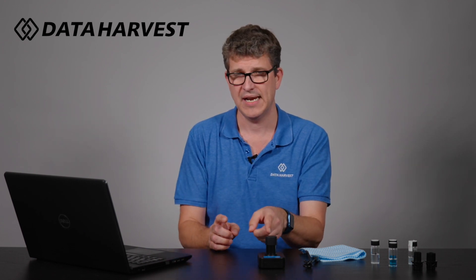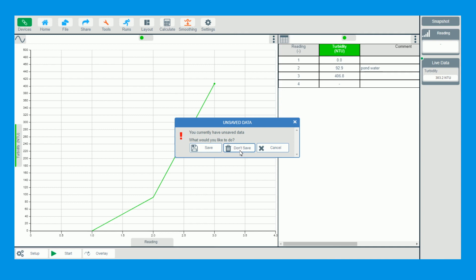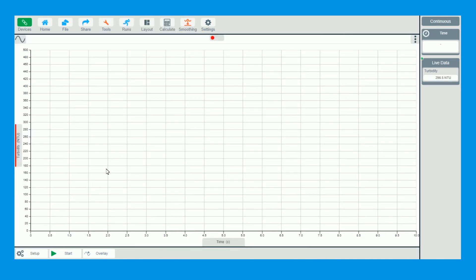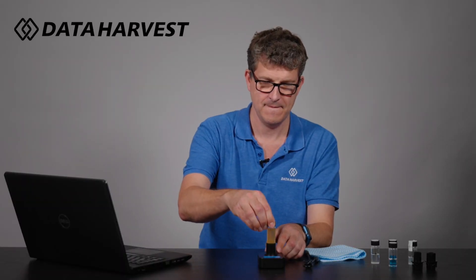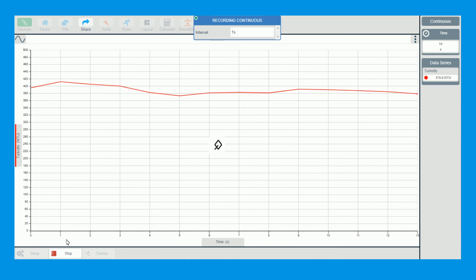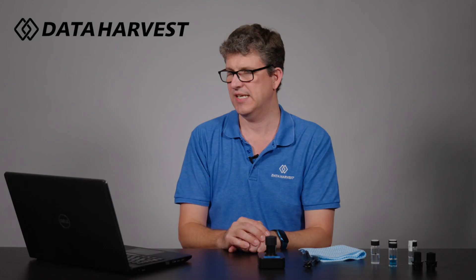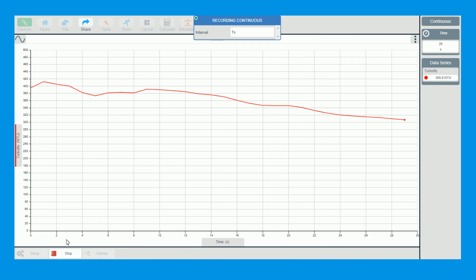That was snapshot mode. Now I'm going to use the apple cider vinegar again but log it against time. I'll click Stop, go to Home without saving that data, then click Graph. We agitate it again, put the lid back on, and click Start. You can see how quickly the turbidity starts to come down — it's settling and dropping nicely. The first seven or eight seconds it was still mixing around, and now you can see it starting to drop. You can leave it logging as long as you like to see what NTU it comes down to when it's fully still.